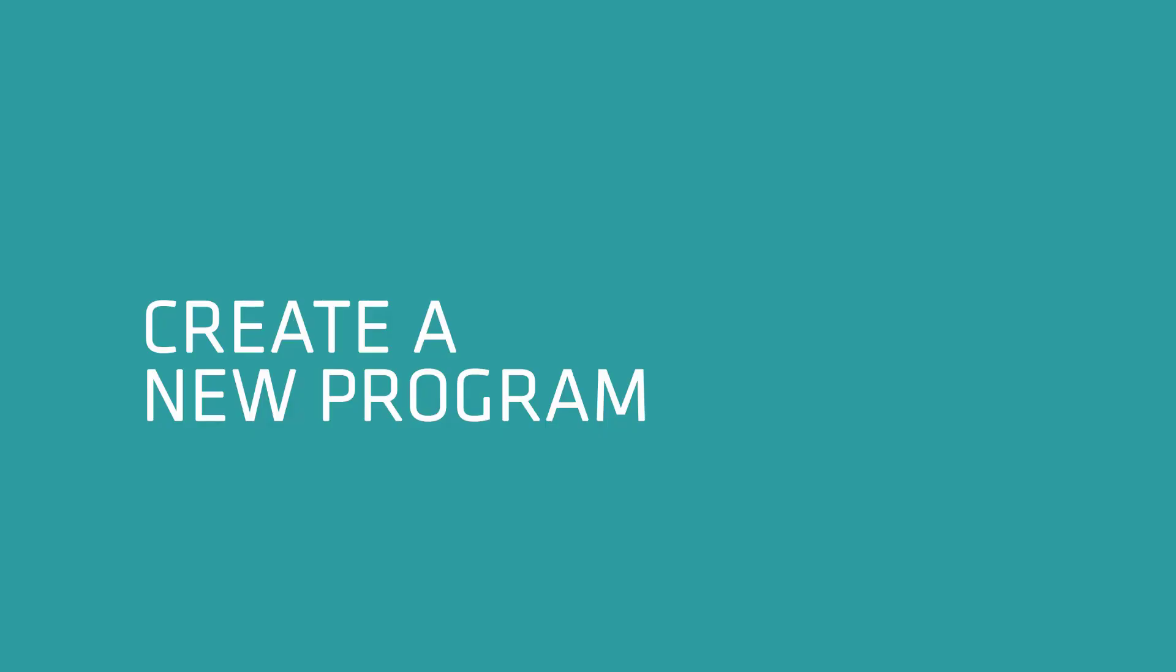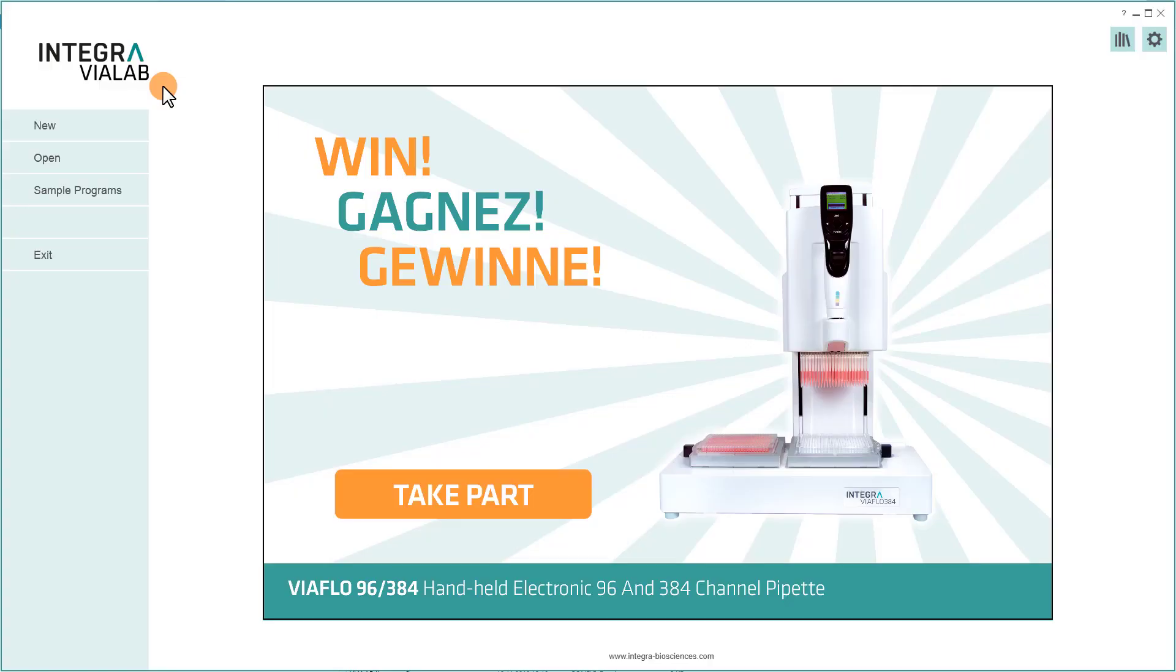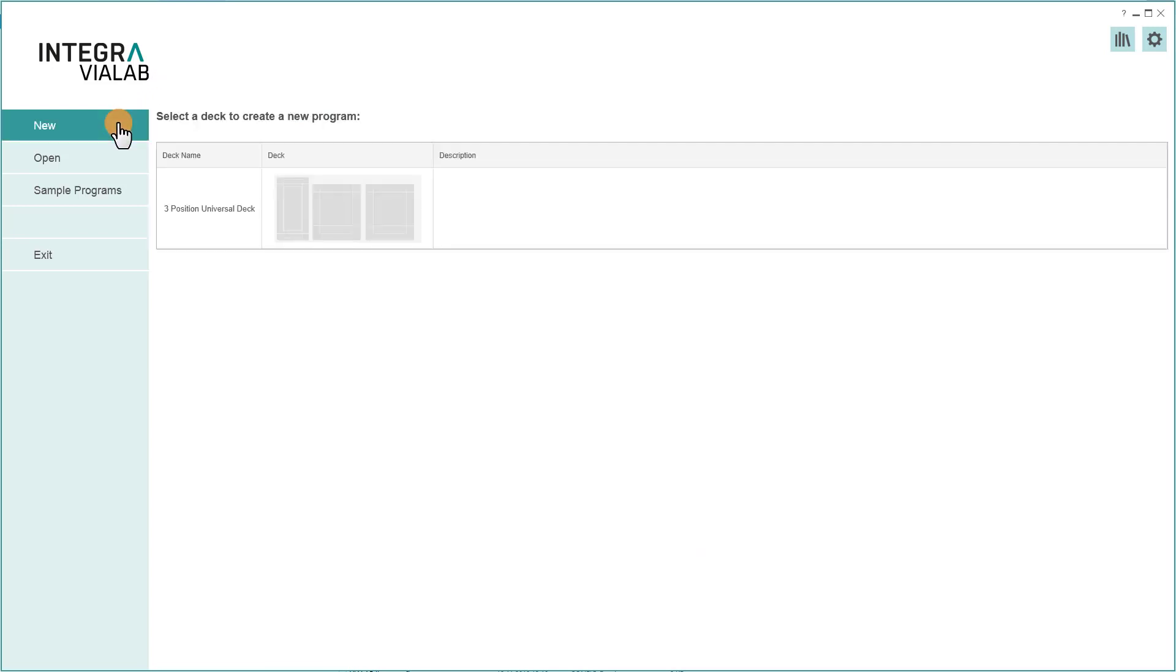So let's create a new program. Click on New and choose the deck which is used on your Assist Plus instrument.